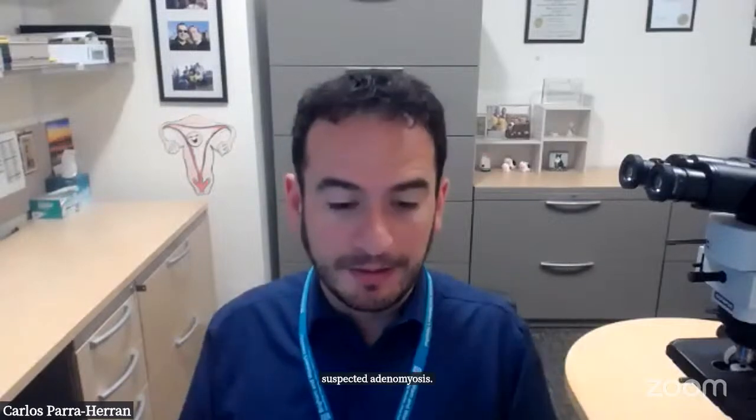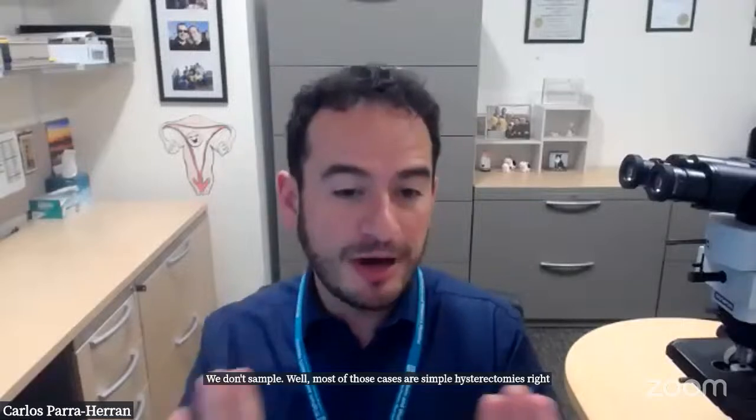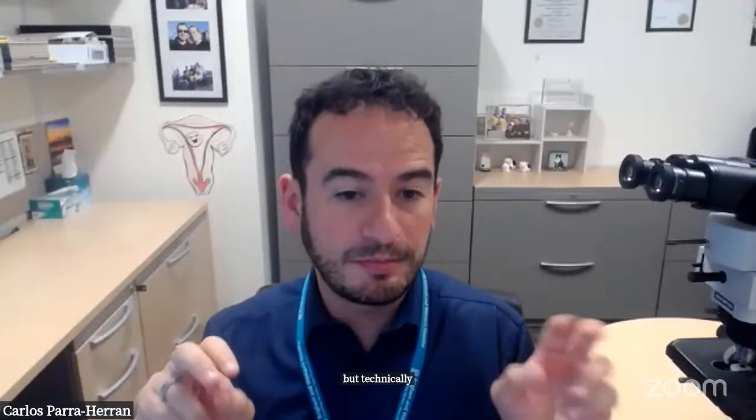protracted uterine bleeding with no confirmation of cancer, leiomyomas, suspected adenomyosis, prolapse. We don't sample. Well, most of those cases are simple hysterectomies, right? In which case you do have an outer edge, but technically not parametrial tissue.